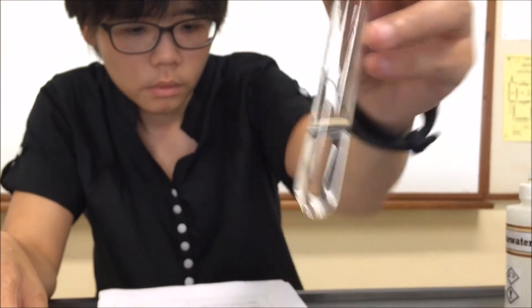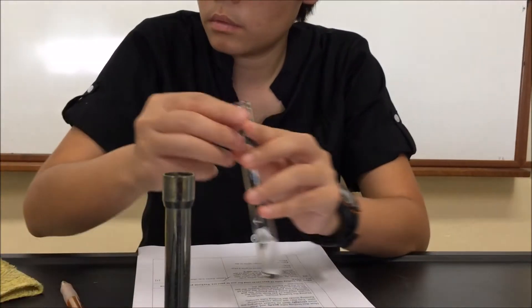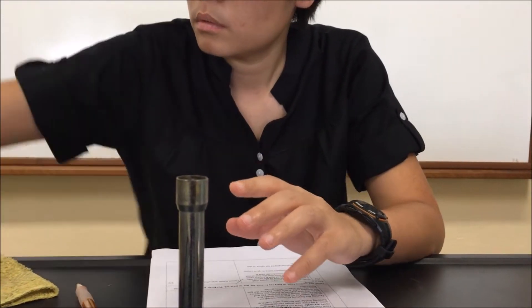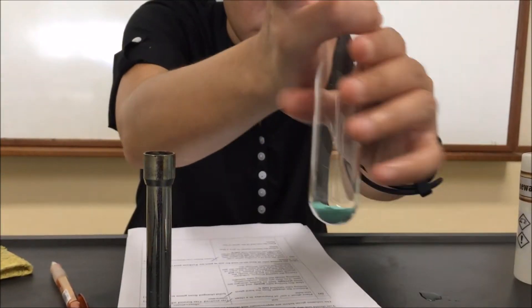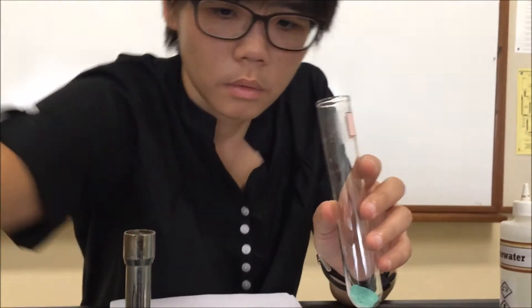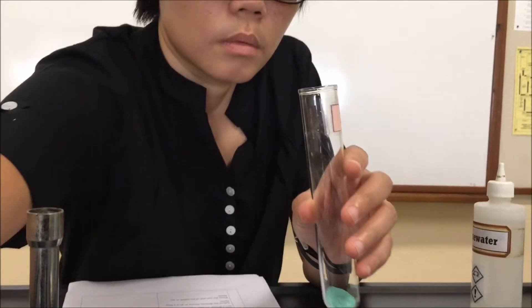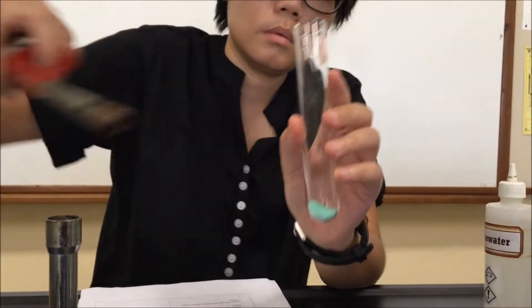Then we get ready to heat salt X, which is this green solid, green powder. So we remove the stopper, close the air hole like the branch of a Bunsen burner. We will heat the tube gently, we always start heating gently.